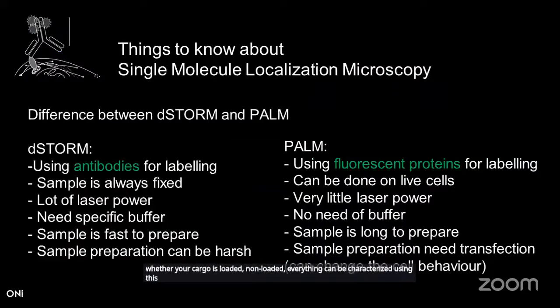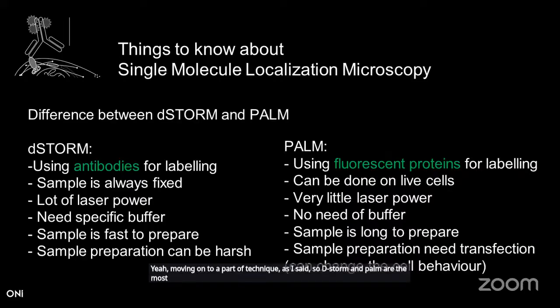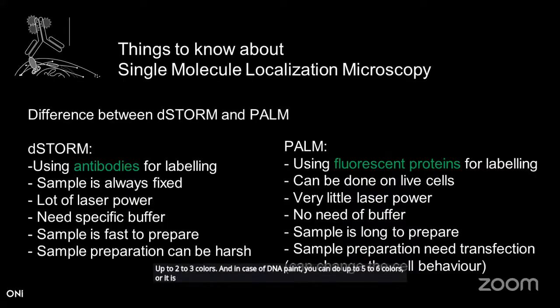So moving on to the part on techniques, as I said, dSTORM and PALM are the most common super res techniques generally used in most of the labs. Nevertheless, DNA-PAINT is also being used in most of the labs. In case of dSTORM, you can do up to 3 colors. In case of PALM, you can also do up to 2 to 3 colors. And in case of DNA-PAINT, you can do up to 5 to 6 colors, or technically it is unlimited, we say. But to standardize DNA-PAINT is a little difficult.